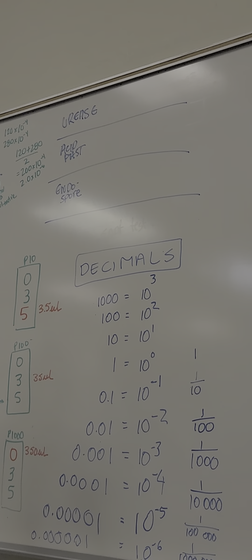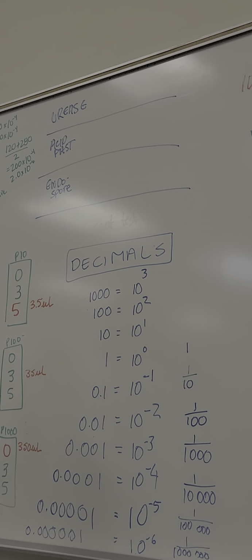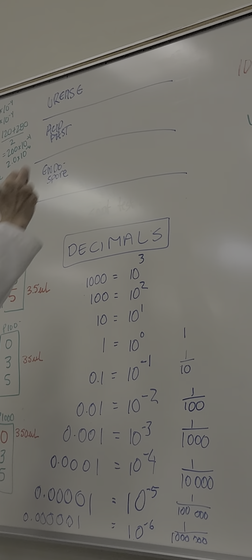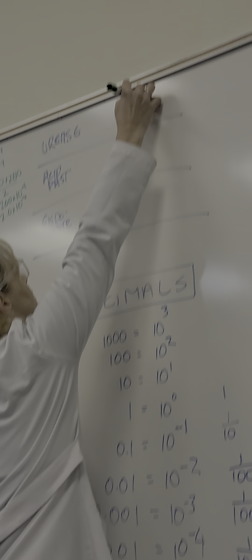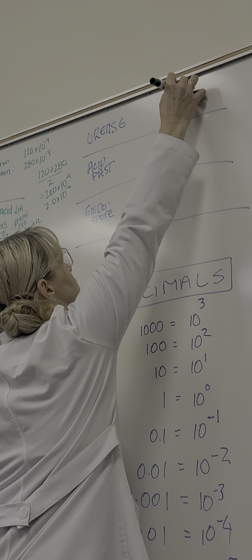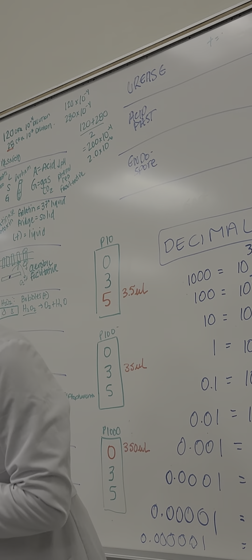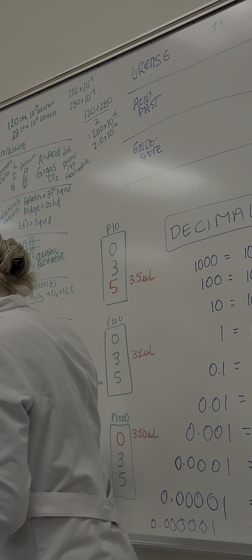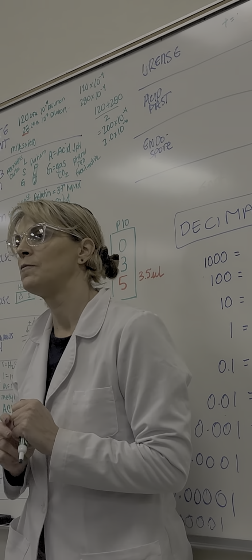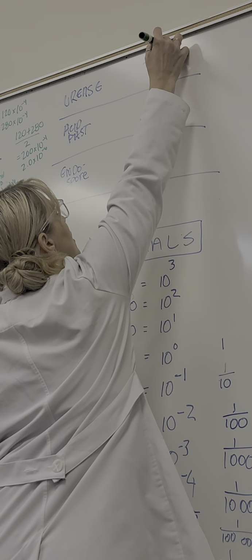What are we looking for in urease? What is the whole point? It is identification. What does a positive look like? Just remember, this one's the blue one. Pink. So yellow was negative.